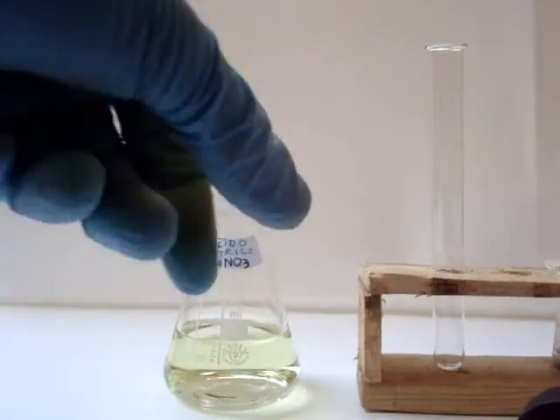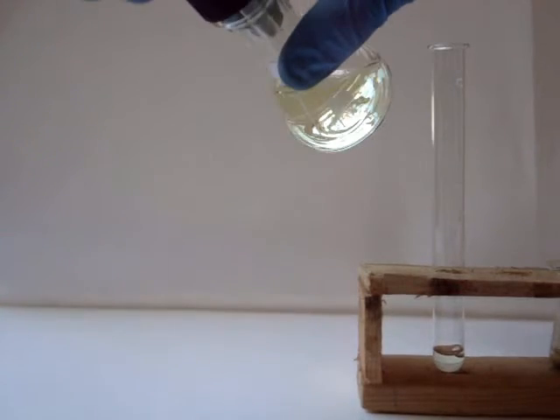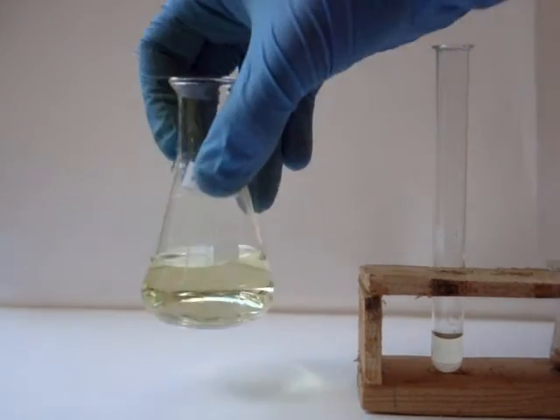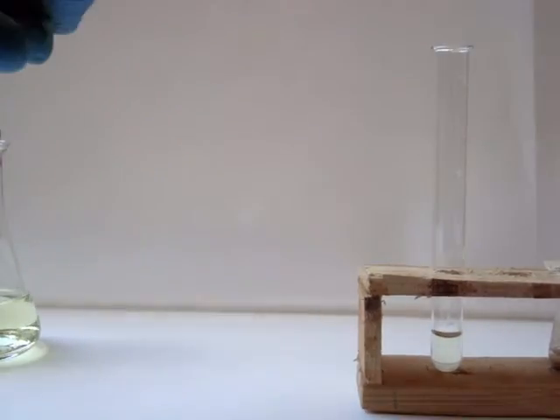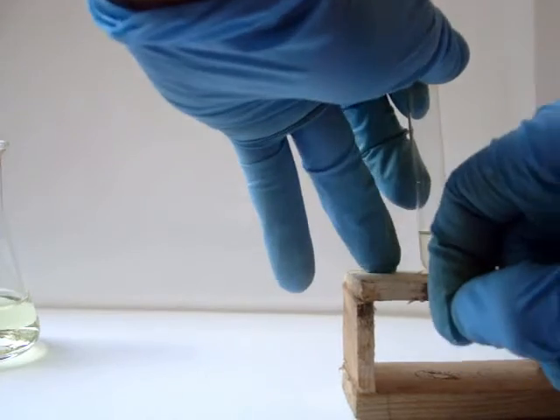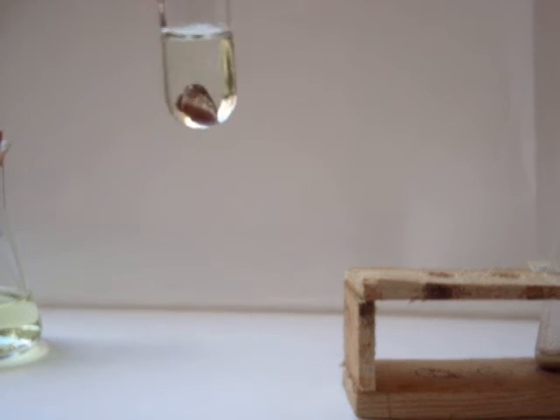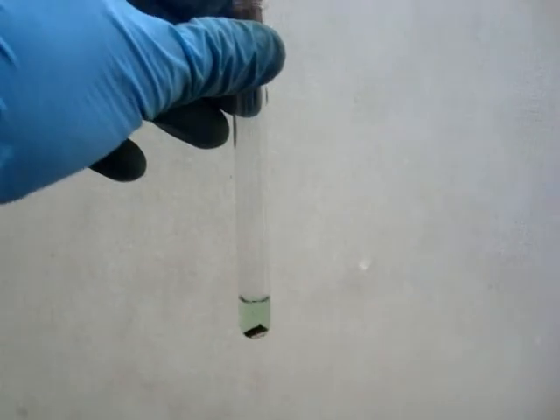To test it, add some to a test tube and then put in a small piece of copper or lead. It is bubbling, which means that nitric acid is present. After a little bit the solution turns to a pale blue, which indicates the presence of copper nitrate.